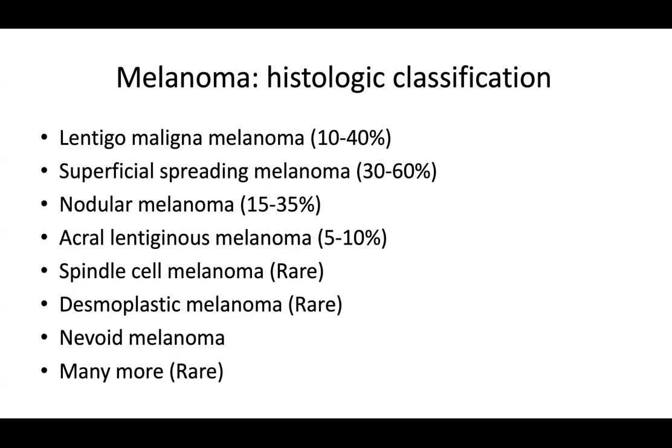You usually will not see multiple rete ridge span involvement of the nodular melanoma, or else that would be more of a superficial spreading melanoma with a significant vertical growth phase. Nodular melanoma, by definition, is truly that it just went right into the dermis pretty early.